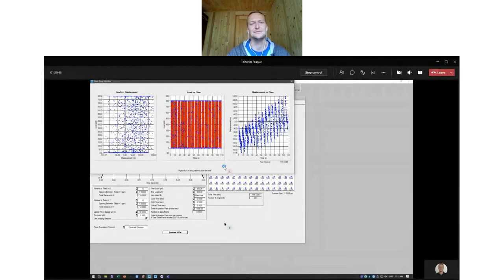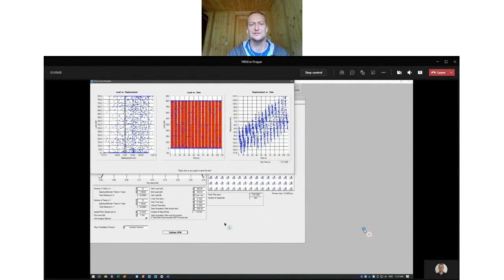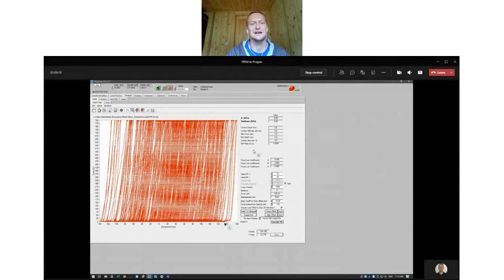Right? So I did two indents with the piezo automation, and basically in the same time, I was able to finish 225 indents. And of course I will have more information from the sample, because I would already see the distribution of different phases and at least approximately what the mechanical properties are, so you can really tune the parameters very fast, and you see what your sample is about.